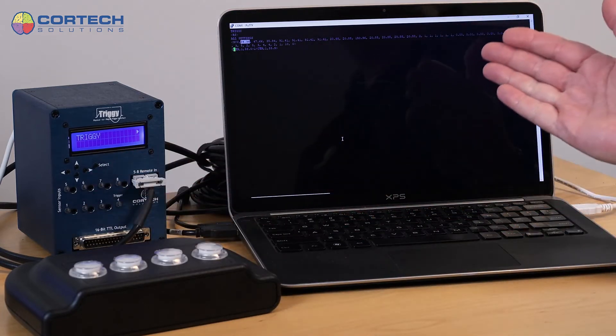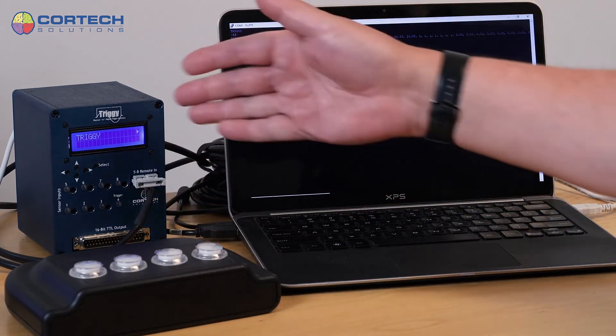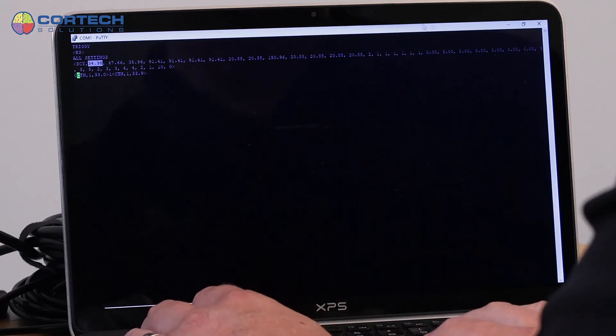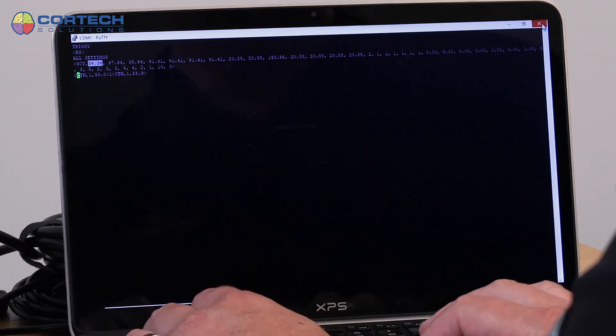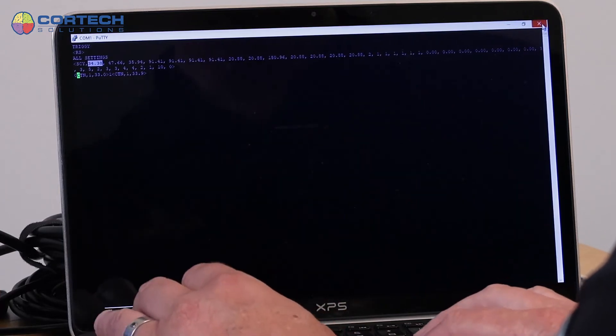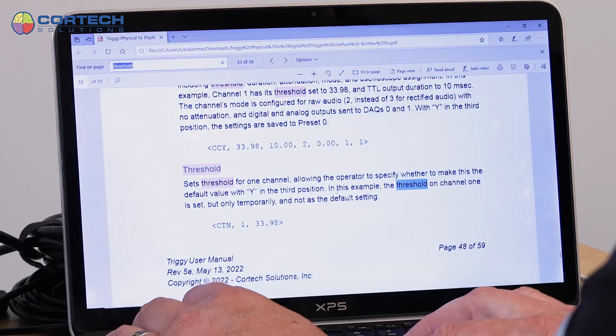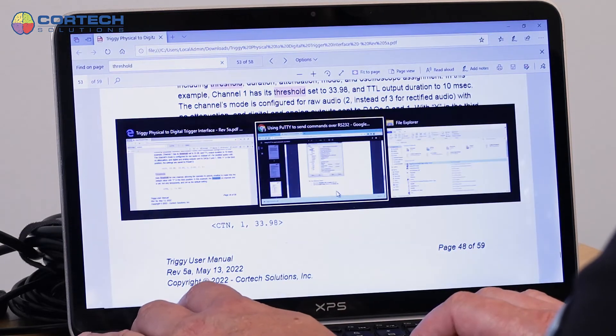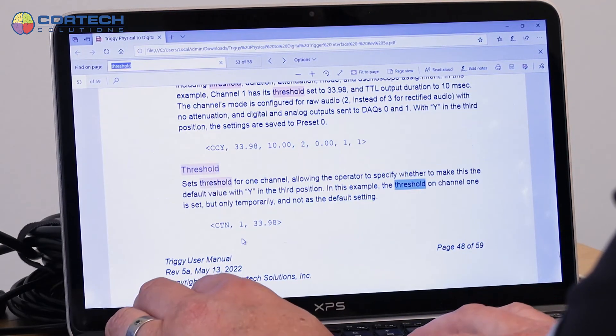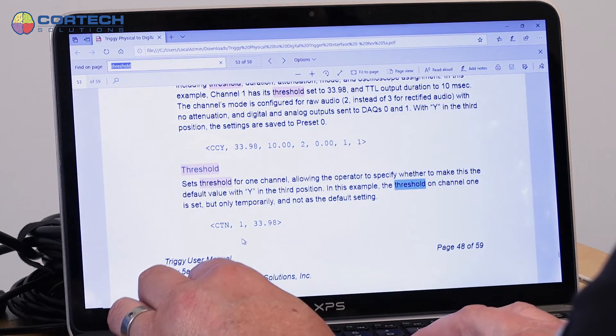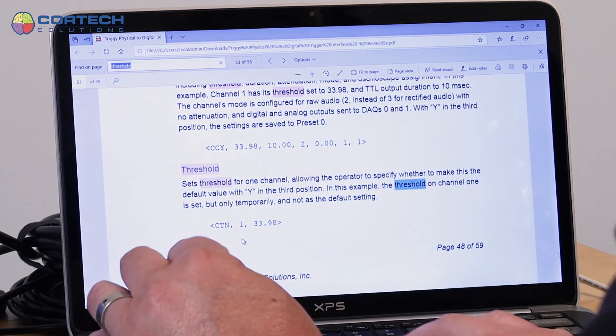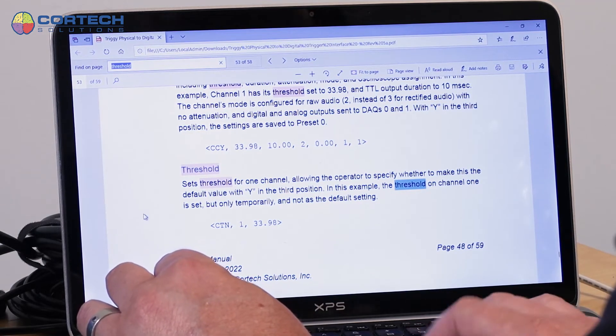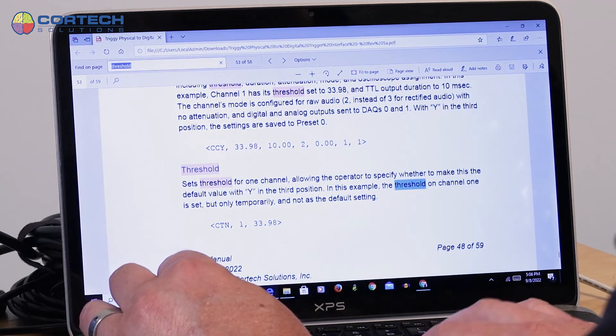So that's an example of how you can send commands to Triggy. Another way to do it would be in your experimental control software, for example.